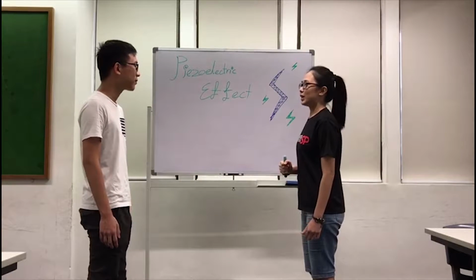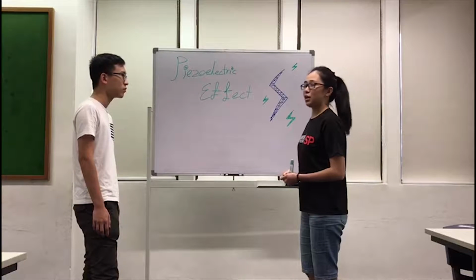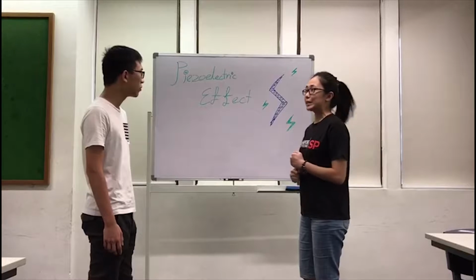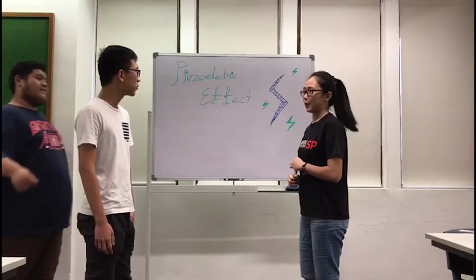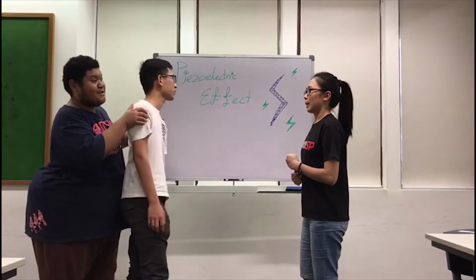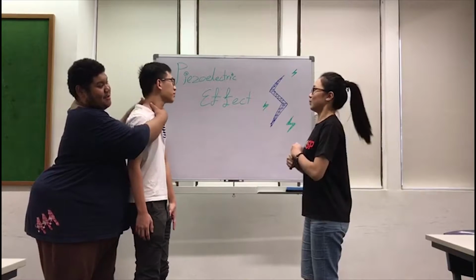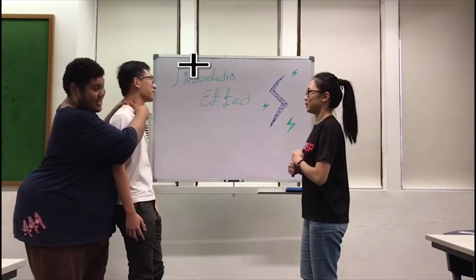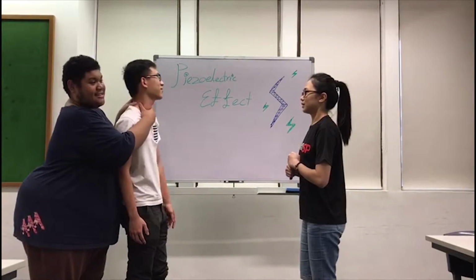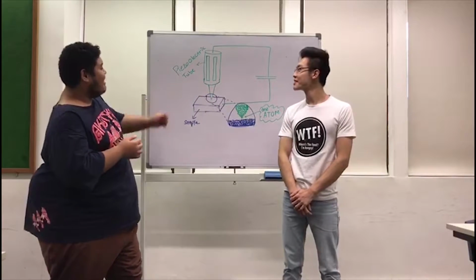Piezoelectric is any material that when placed under pressure or stress, exerts voltage, or vice versa. And this means that when voltage is applied, pressure is induced. So if Philip was a piezoelectric and I squeeze him, there will be positive charges here and negative charges here, and a voltage will be induced, right? Correct. I see.